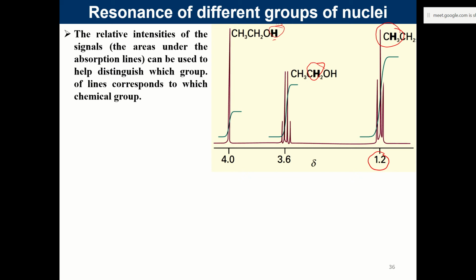And then the ratio of the intensities. You can see it is split into a triplet; it is not a single peak that you are observing for methyl protons. Instead, you are observing three peaks, a set which are spaced equally. Then you have a quartet for the protons from CH2. So we will take up this splitting pattern at a later stage.